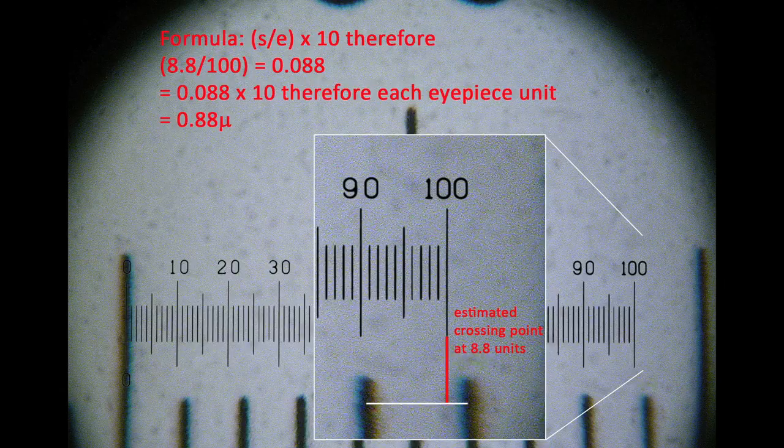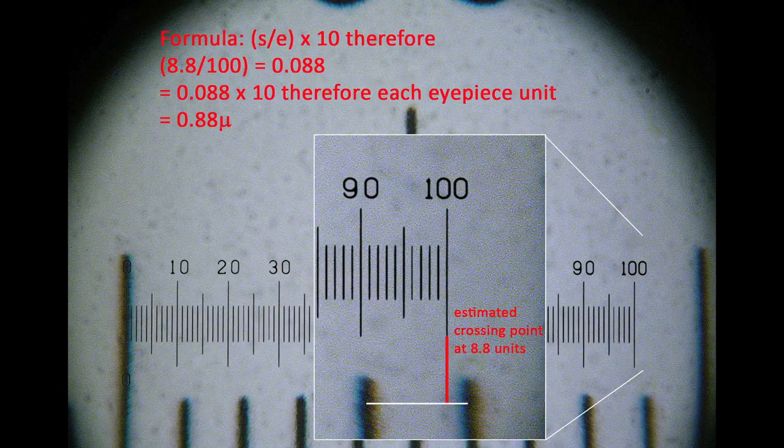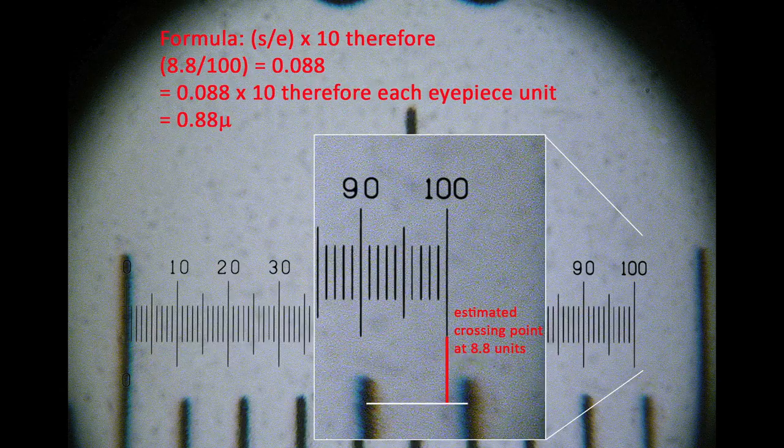If you again think about magnification and subsequent decreasing field of view, by going from the 40x to the 100x objectives, although you are increasing the magnification by 2.5, the field of view is reduced by the same factor.